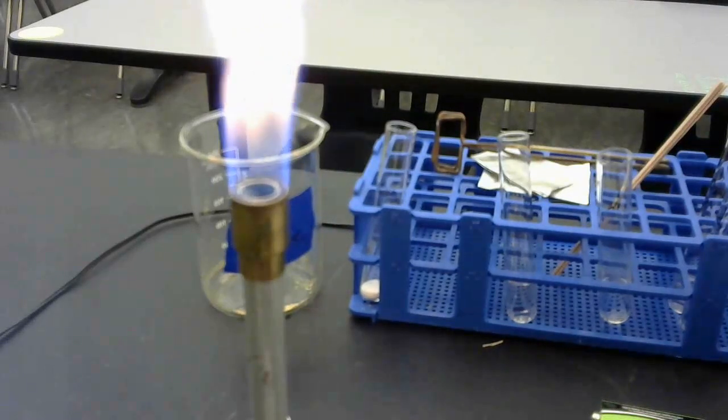You want to make sure that you write your balanced chemical equation. We have magnesium reacting with the oxygen in the air to produce magnesium oxide, okay? Make sure you write your word equation, you do your balanced equation, and you include your observations, okay?